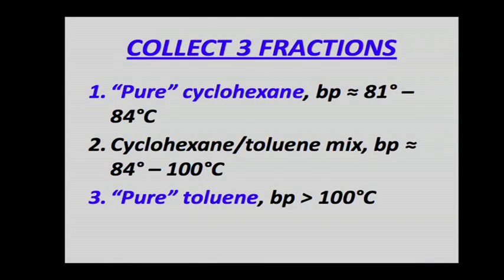So what we'll see is the temperature at the head of the column will get to 81 degrees as the cyclohexane starts to boil. As the cyclohexane is condensed off, now the composition in the still pot is shifting to higher and higher levels of toluene. And so the temperature is going to rise. The head temperature is going to rise gradually. And this allows us to take off several fractions, thus the term of fractional distillation. We're going to do three fractions. The first fraction we'll collect. We're going to call it pure, and I'm putting pure in quotes. It's not going to really be pure, but it'll be mostly cyclohexane. And we'll collect that fraction between the boiling points of about 81 and 84 degrees. So when the head temperature on the thermometer is around 81 to 84, that'll be the cyclohexane fraction.